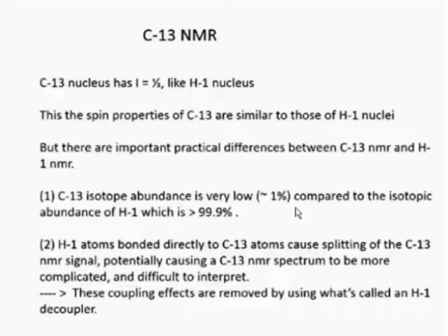The average of these scans is recorded, and the average scan tends to cancel out random noise signals, leaving behind the observable C13 signals. So it's easier then to see those small C13 signals if one removes the noise peaks that would normally accompany them. Noise peaks can be about the same size as the C13 signal peaks.